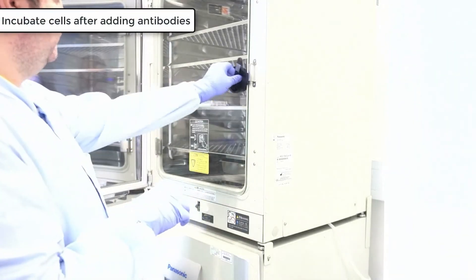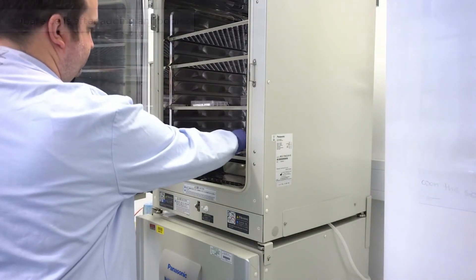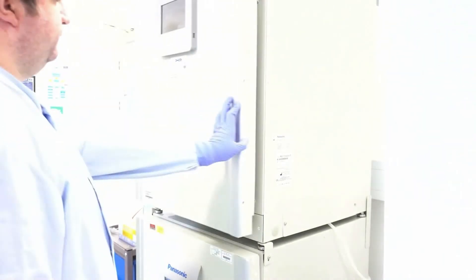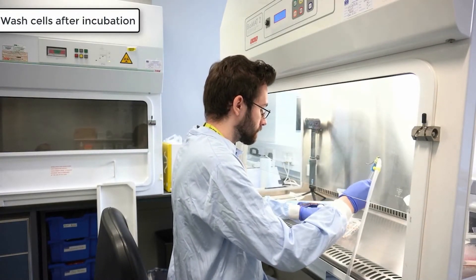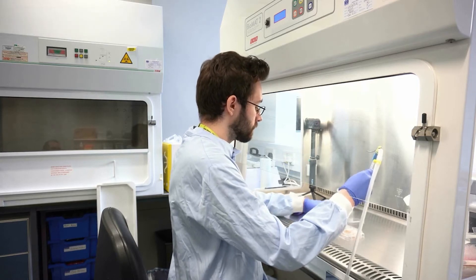Gently agitate the plate to ensure even distribution of antibodies. Then transfer the plate to a 37 degree incubator and incubate for 30 minutes. Once the incubation is complete, we perform a wash step. Aspirate the media and add 2ml of FluoroBrite DMEM per well.